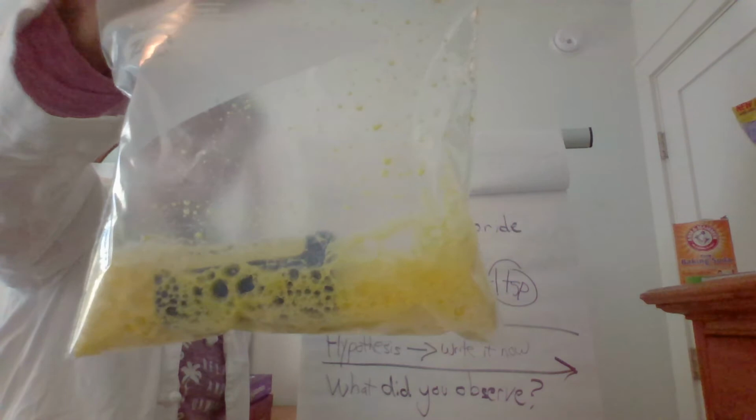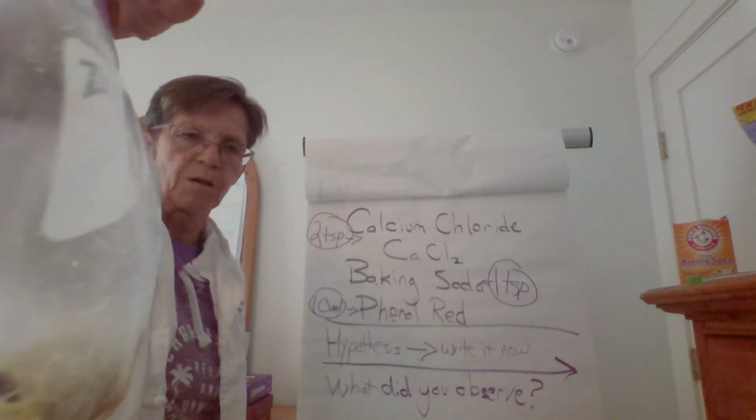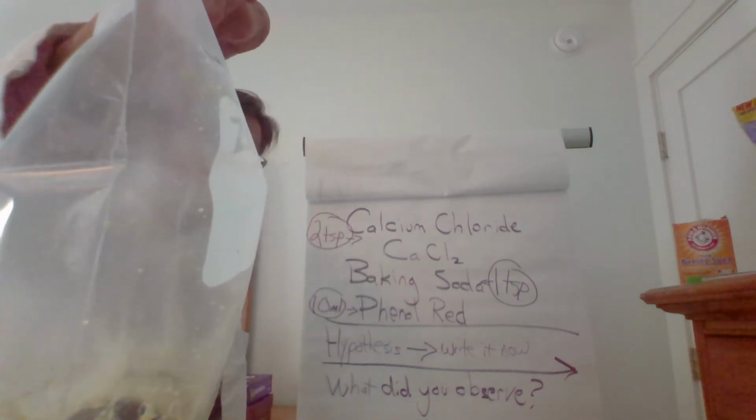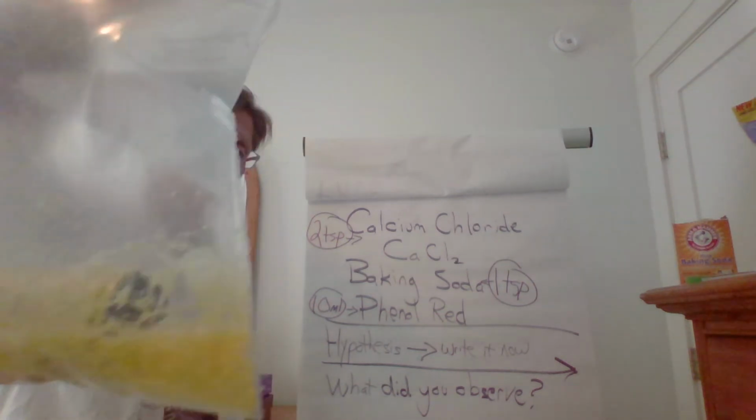Right? And hopefully you're getting a really good picture. So I'm going to turn it, just keep turning it a couple of times, right? I'm going to kind of turn it sideways so you can see what's happening to the bag, right? And I'm going to feel it.